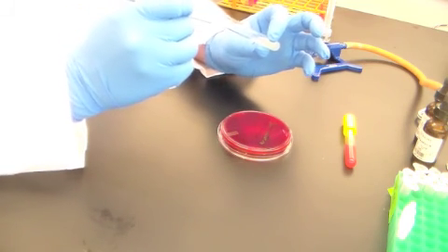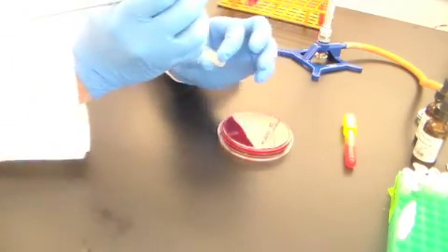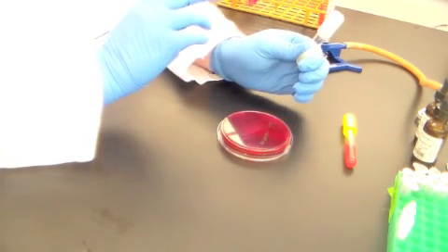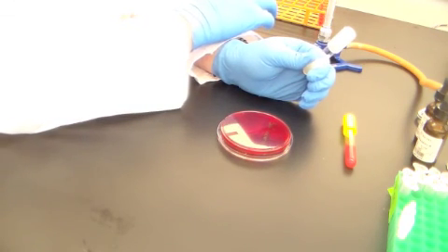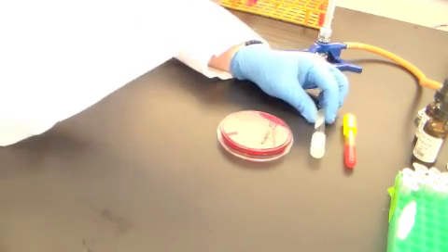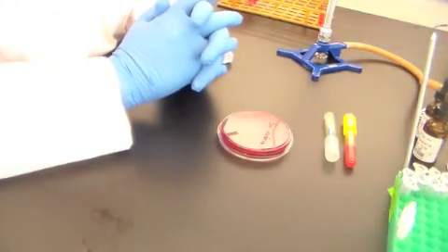You're welcome to. I don't know if that's helpful, because we're going to assay after fall break for the ability of Salmonella enterica and some other bacteria to deaminate the amino acid phenylalanine. And again, I'm putting up a PDF to explain this test in more detail and in clearer terms than I am. That's going to be found very shortly in the Blackboard site.